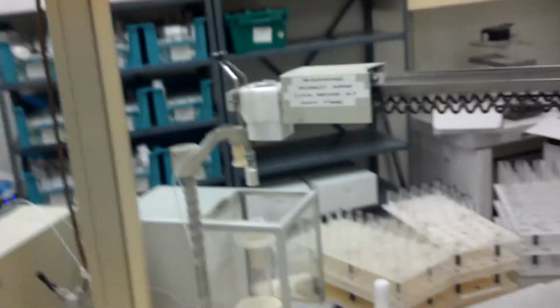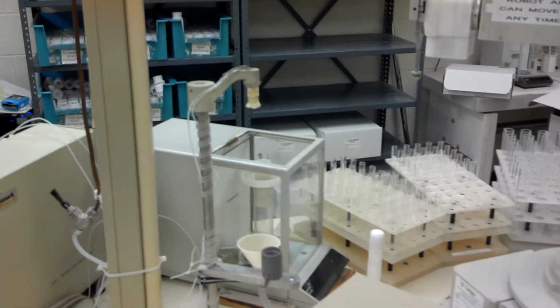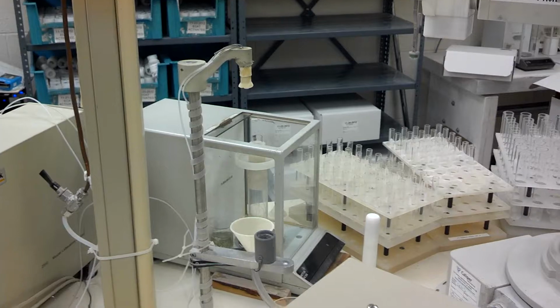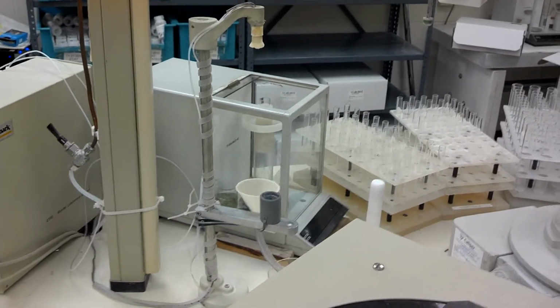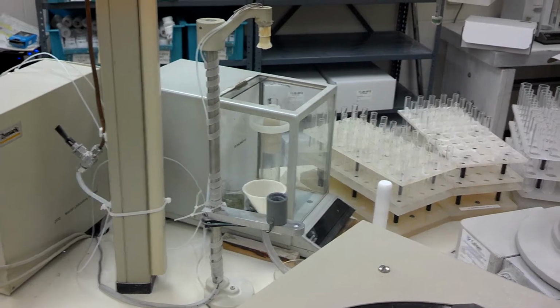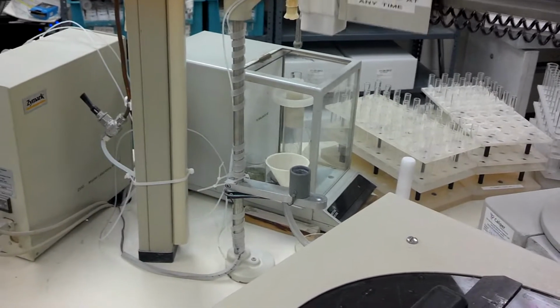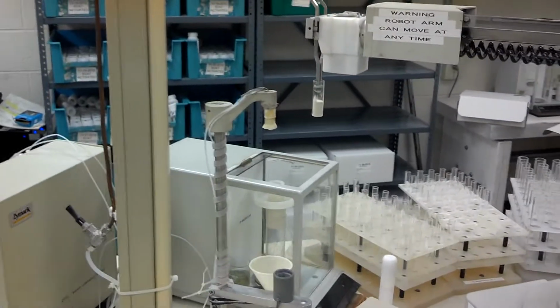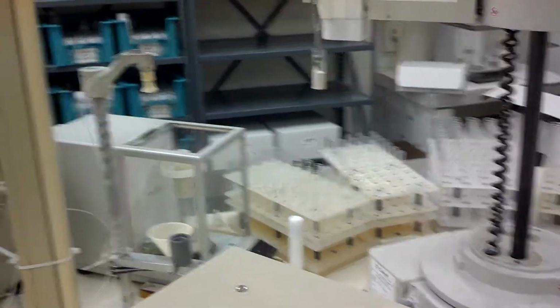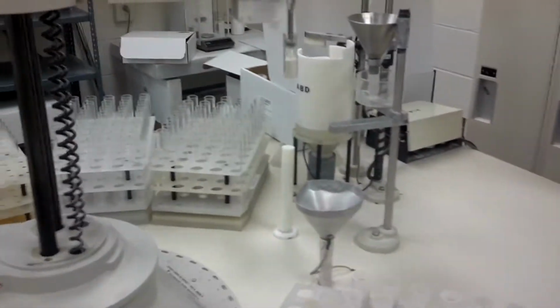They're going to weigh that so they know how much of the catalyst they put in. That's right. Okay. So that's why we needed to put a tare weight on the empty vial, the empty vial with the initial compound in there, right? Right. So that's going to go back in here.